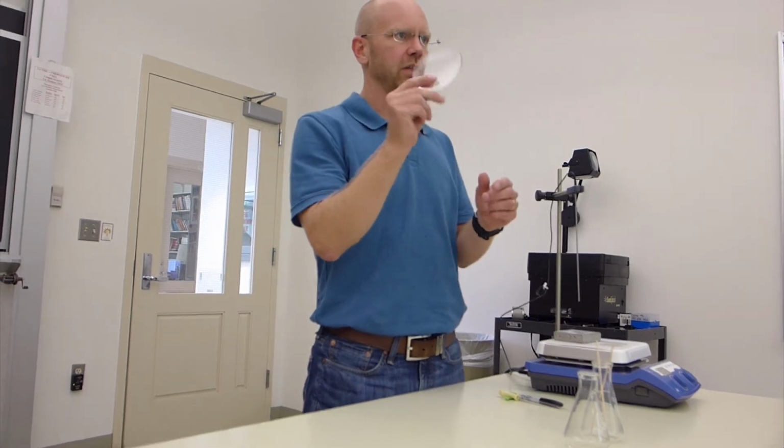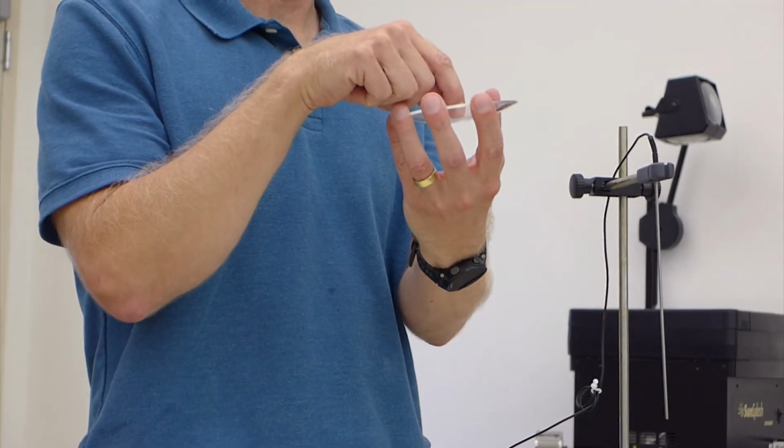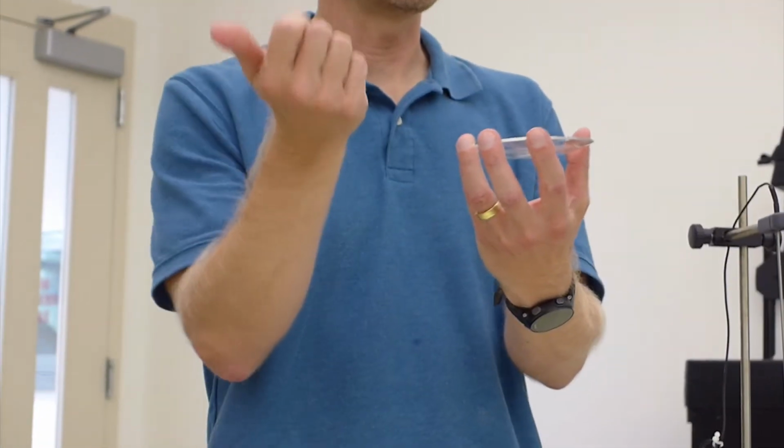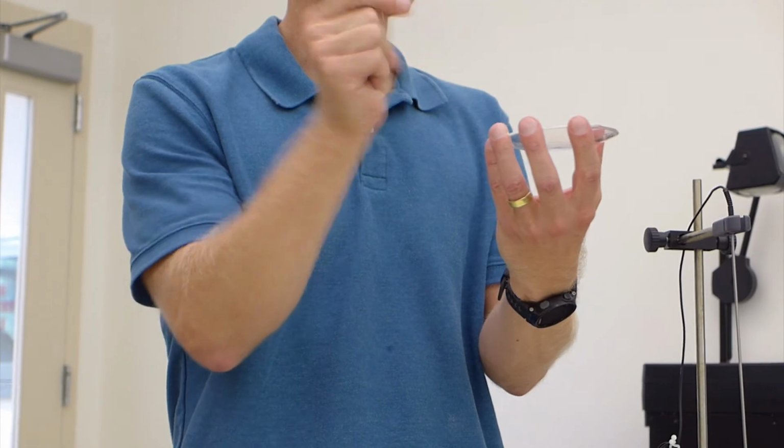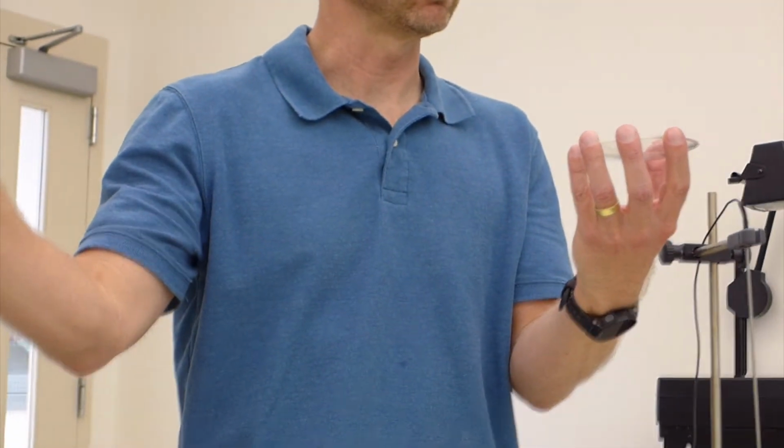The way I like to do this protocol is I like to get an evaporating dish like this. And I like to put a crystal of the compound or some of the solid in the middle, just a little bit, just a tiny bit. And then I take 1 or 2 drops of different organic solvents and I drop them on. If they instantly dissolve, that solvent's out. It's not going to work. That's at room temperature. If it instantly dissolves, that's not a good solvent.